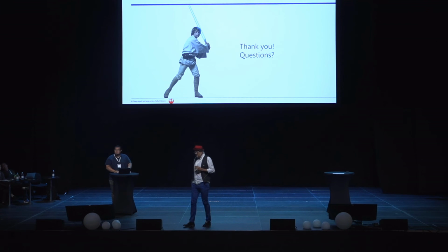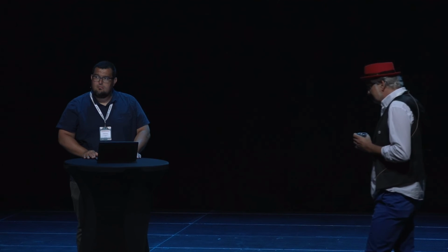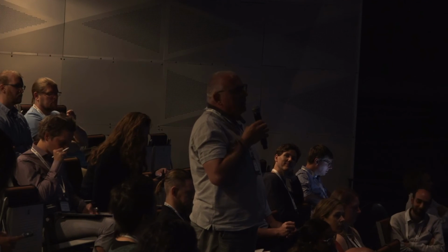My question would be, why did you need to do this? Because the SRRF, I mean, you could do afterwards. This whole complex issue with the two software and so on, if you would use just the Leica software, acquire the images and do the SRRF processing afterwards, what's the advantage of doing it on the fly? Or, I don't know whether the Andor camera is implemented in the Leica software.